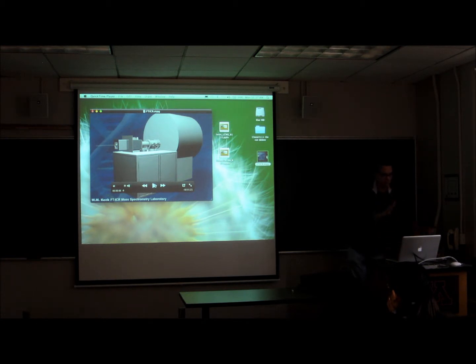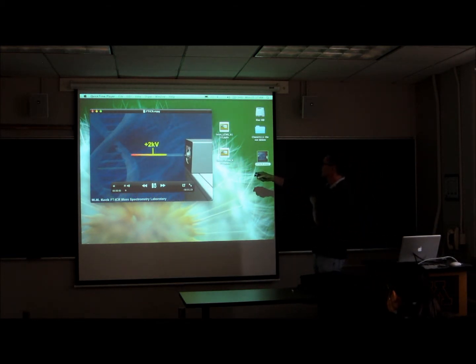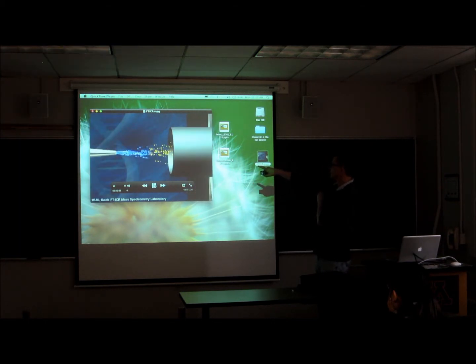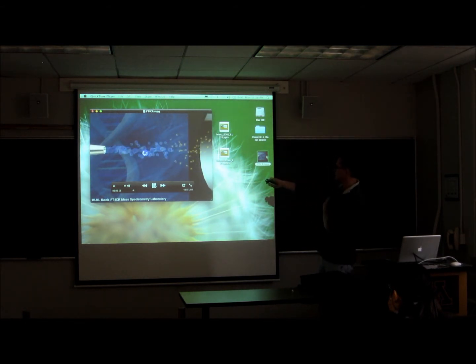And it'll sort of show you ionization through mass analysis in a nice little illustration. So here you've got your electrospray needle at 2 kV. You're forming those charged droplets, which are evaporating. When the coulombic forces overcome the surface tension, you get the naked ions.